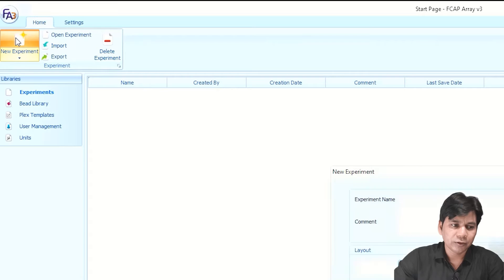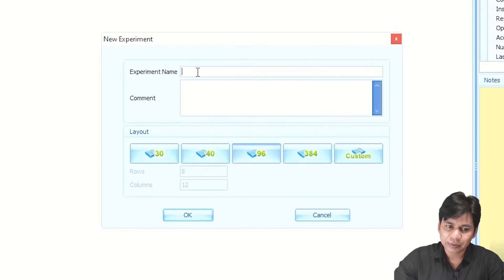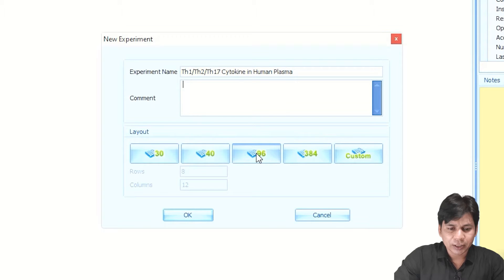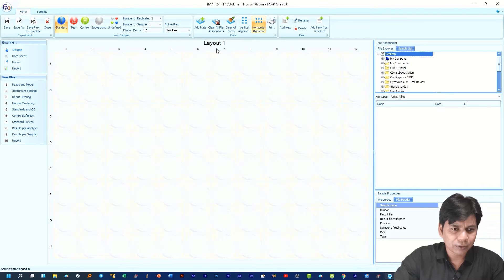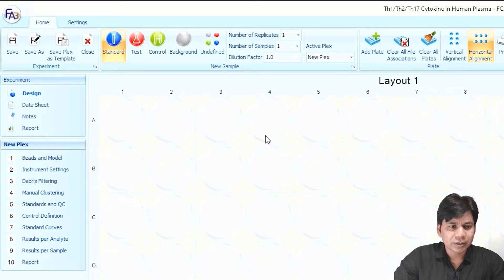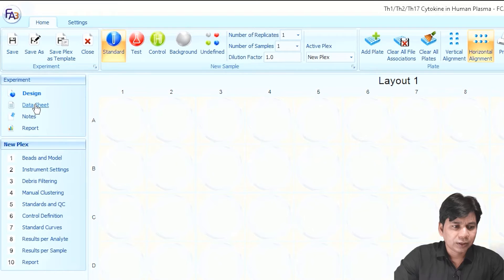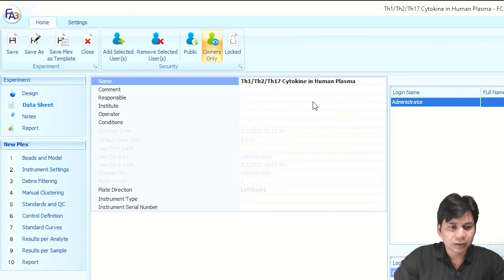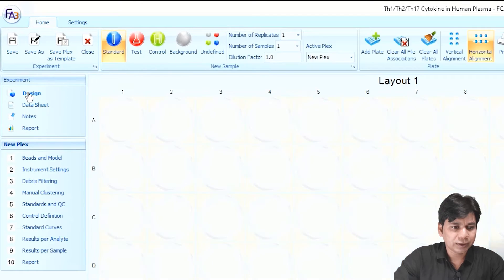For the analysis of new data you have to click on 'New Experiment.' Here you can rename your experiment. If you want to add a comment you can add it here. You have to select the layout according to your experiment — I am selecting 96-well — and click OK. You can see the layout of the experiment. On the left side there are other options. If you click on 'Data Sheet' you can add additional information like institute, operator, and condition.